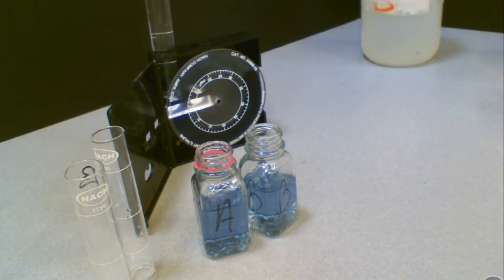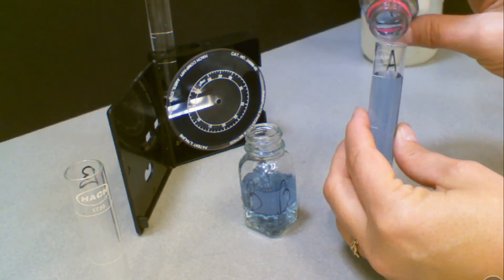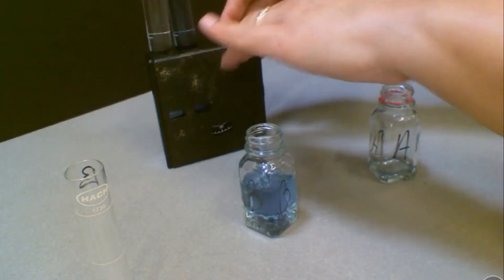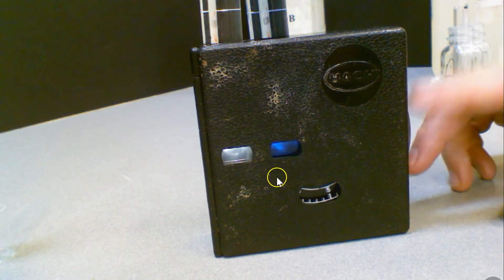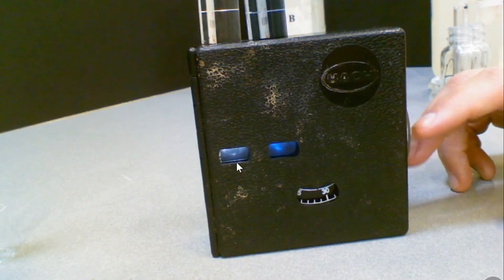We're going to compare untreated water with treated water using the color comparator. Take square mixing bottle A where the chemicals have sat, pour it into the circular test tube, and put that into the color comparator. You should have the untreated water to your left and the treated water to your right. The goal is to get both of these colors to match, and that will give you a reading. You can see this is gradually changing color until you get a match.